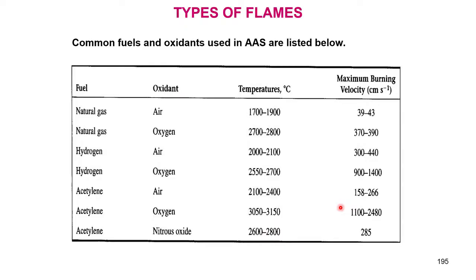Acetylene burns, you must have seen in your roadsides, a lot of welding work, etc., they do it with acetylene. And then there are other gases which can be burnt.